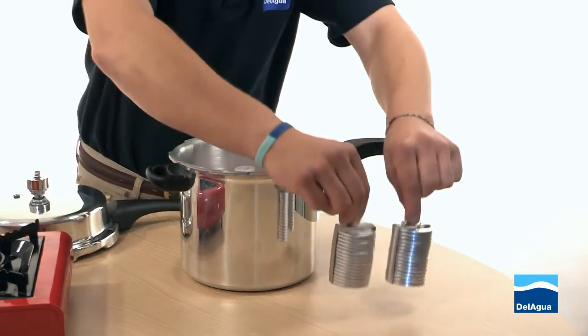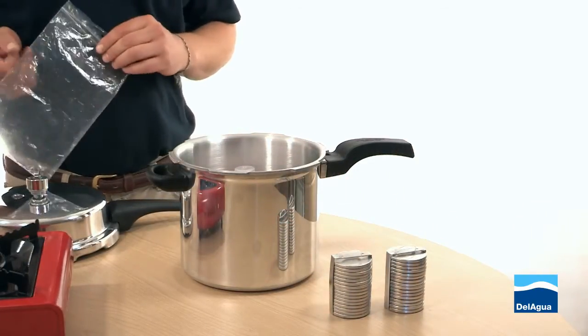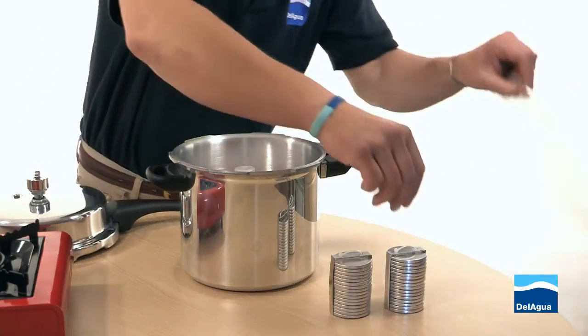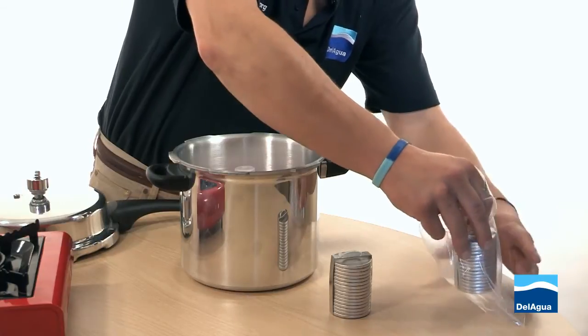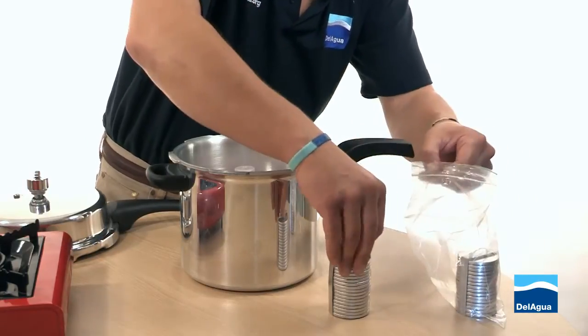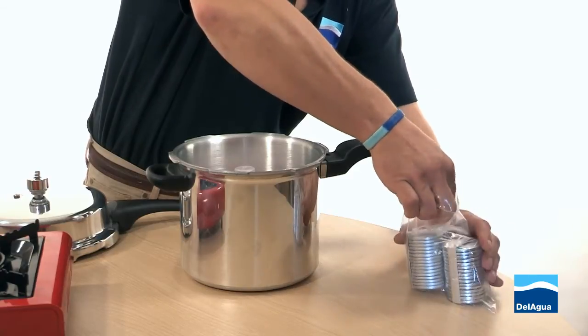Take the petri dishes out. They can either go straight back into the incubation chamber if they are going back out into the field, or if you are storing them for later use, a good idea is to place them into a clean, dry, sterile plastic bag to prevent them getting covered with dust.